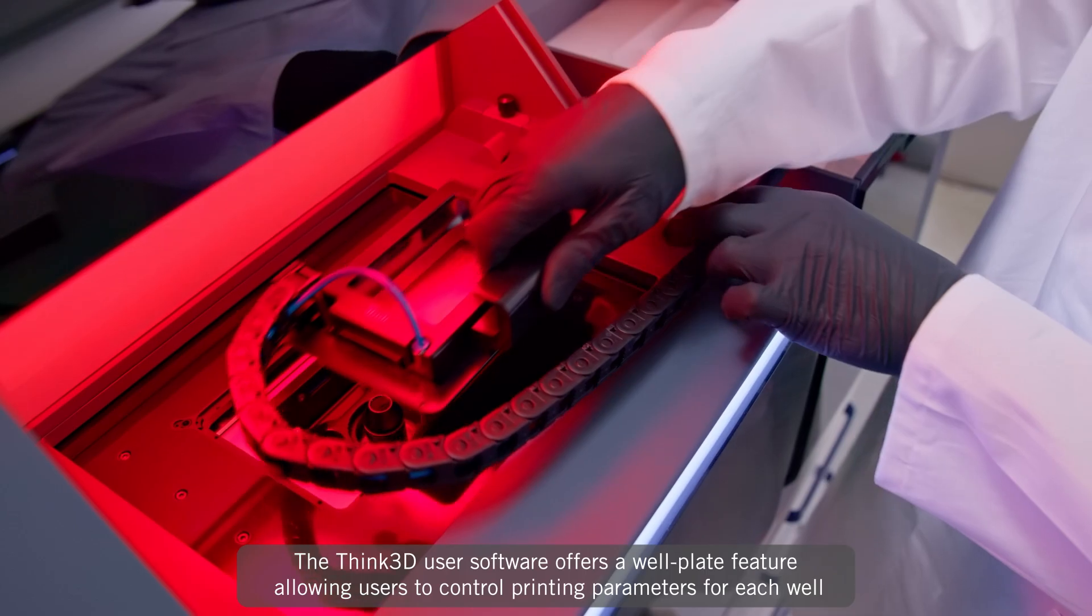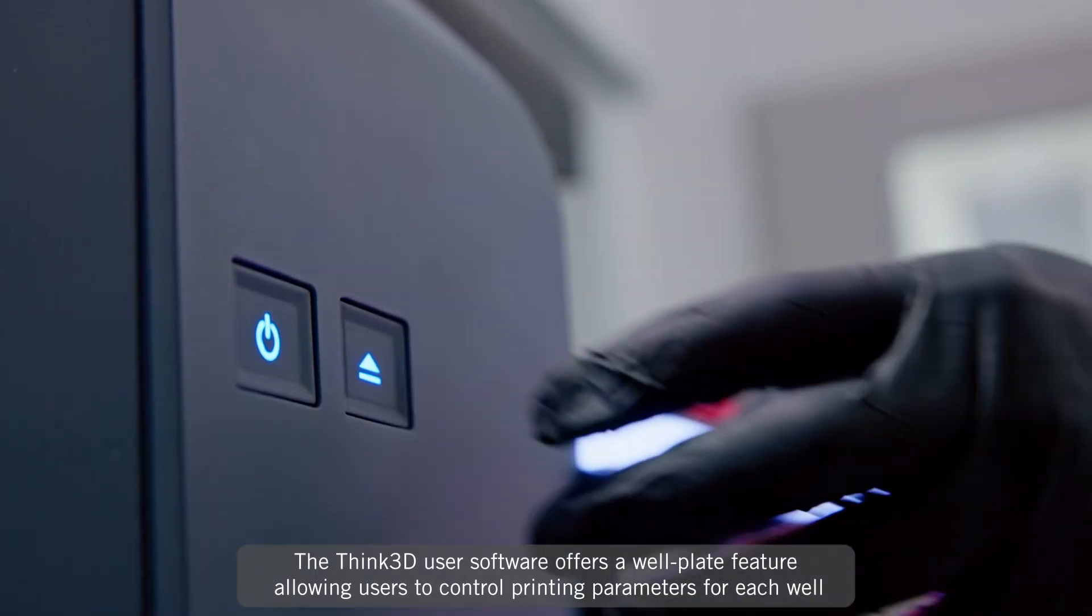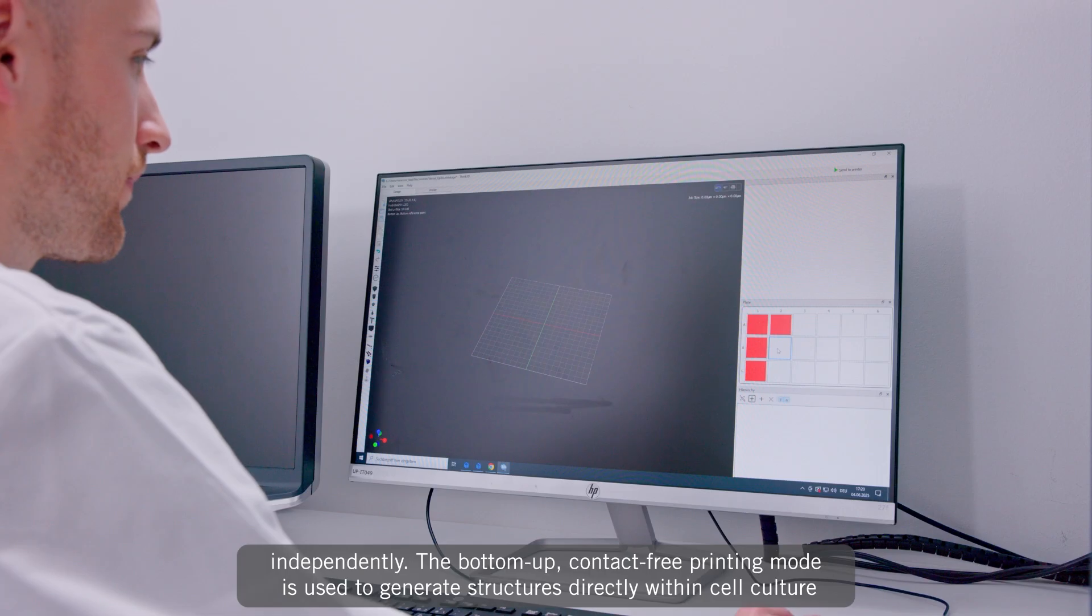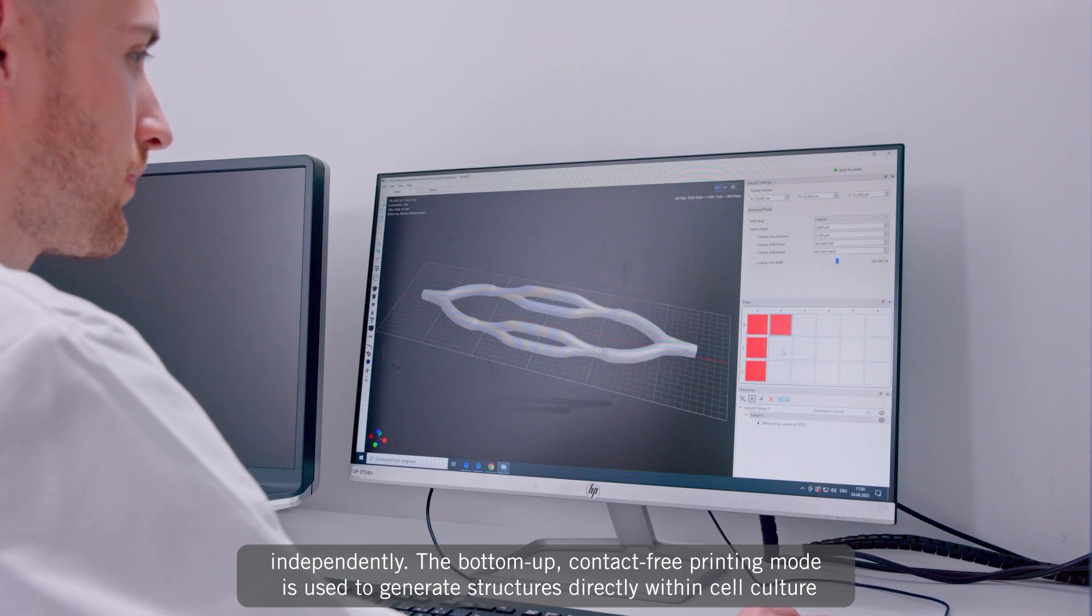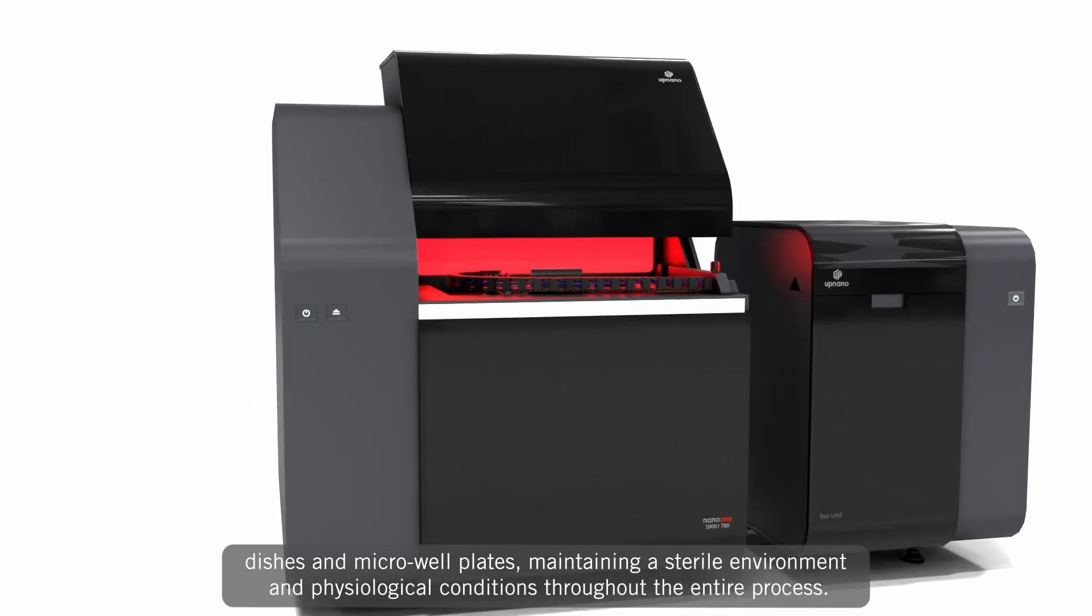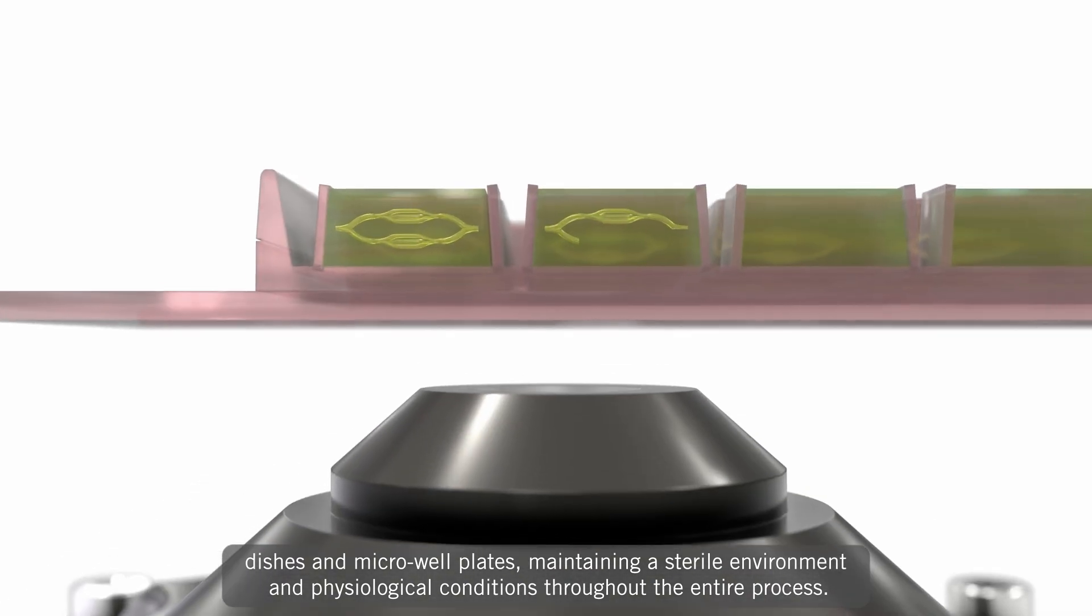The Think3D user software offers a well plate feature allowing users to control printing parameters for each well independently. The bottom-up, contact-free printing mode is used to generate structures directly within cell culture dishes and microwell plates, maintaining a sterile environment and physiological conditions throughout the entire process.